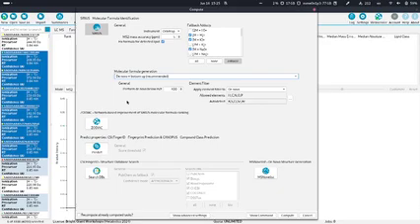And the bottom-up search basically breaks that down. It usually takes just seconds on large mass compounds, which means that in contrast to SIRIUS 5, you can now process a complete LCMS run, also with high mass compounds like 1,000 Dalton, in reasonable time. And so I would say de novo plus bottom-up is the recommended way to compute molecular formulas.